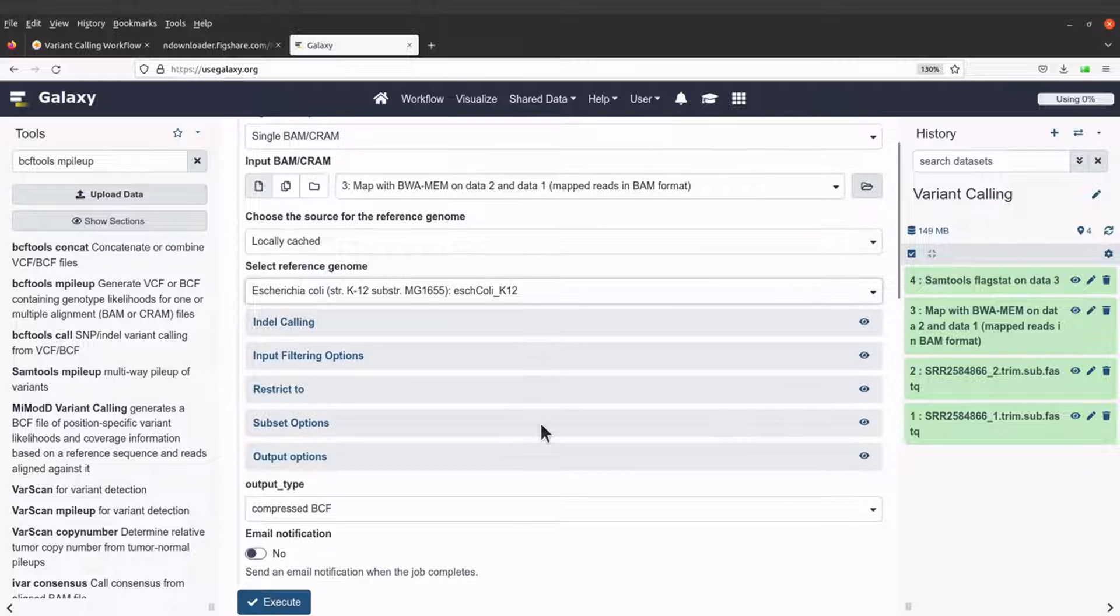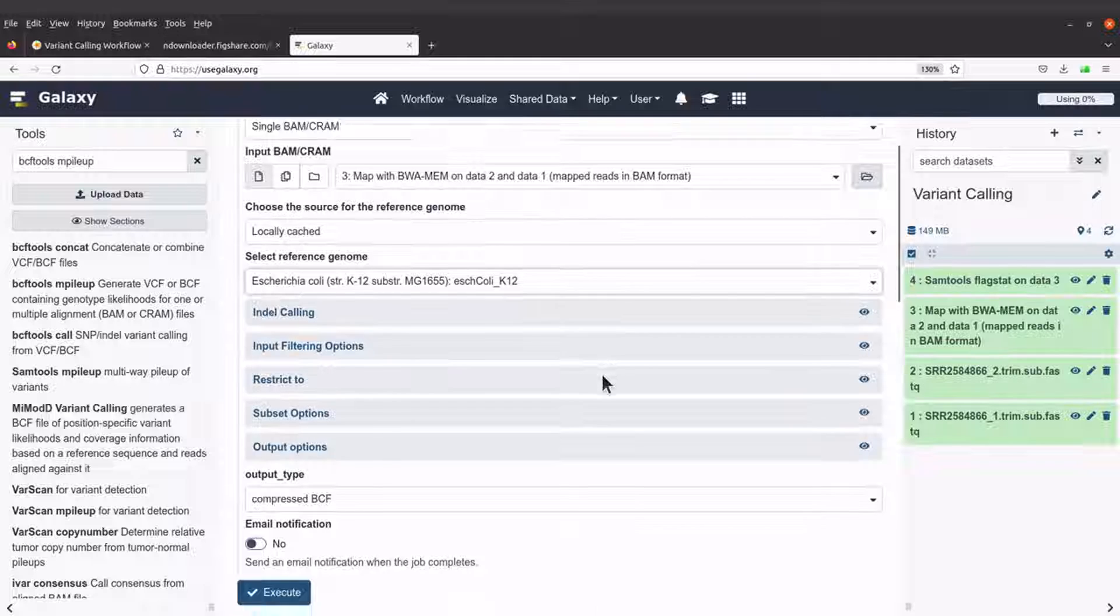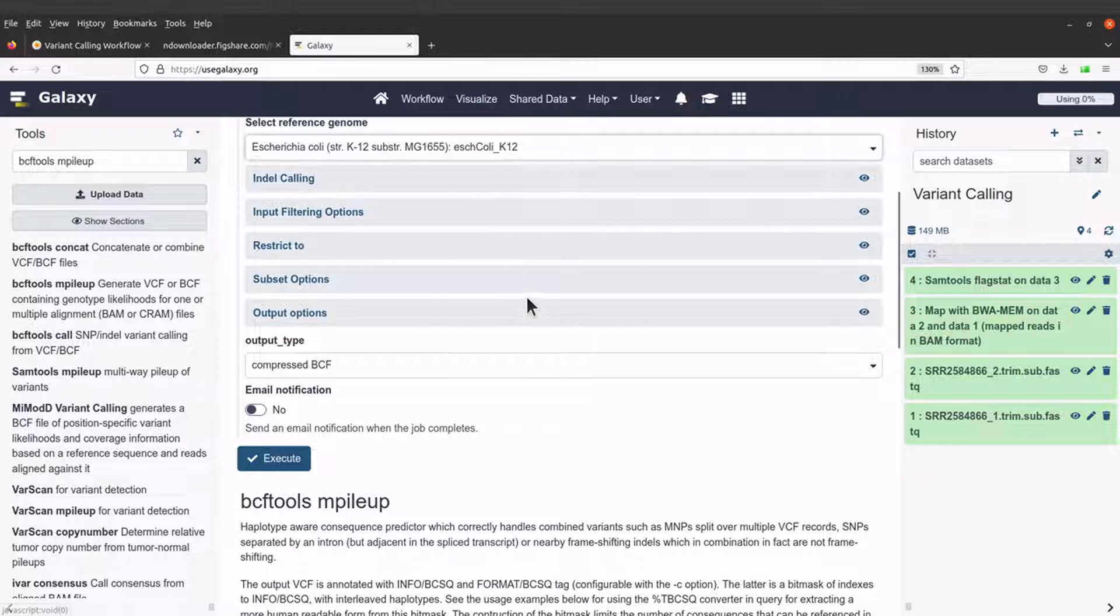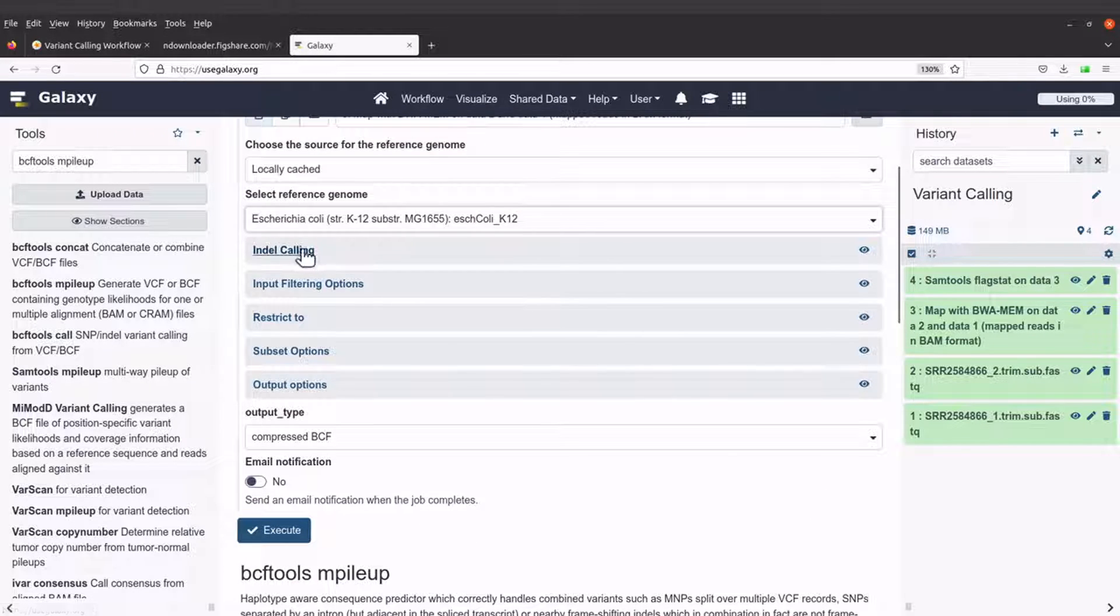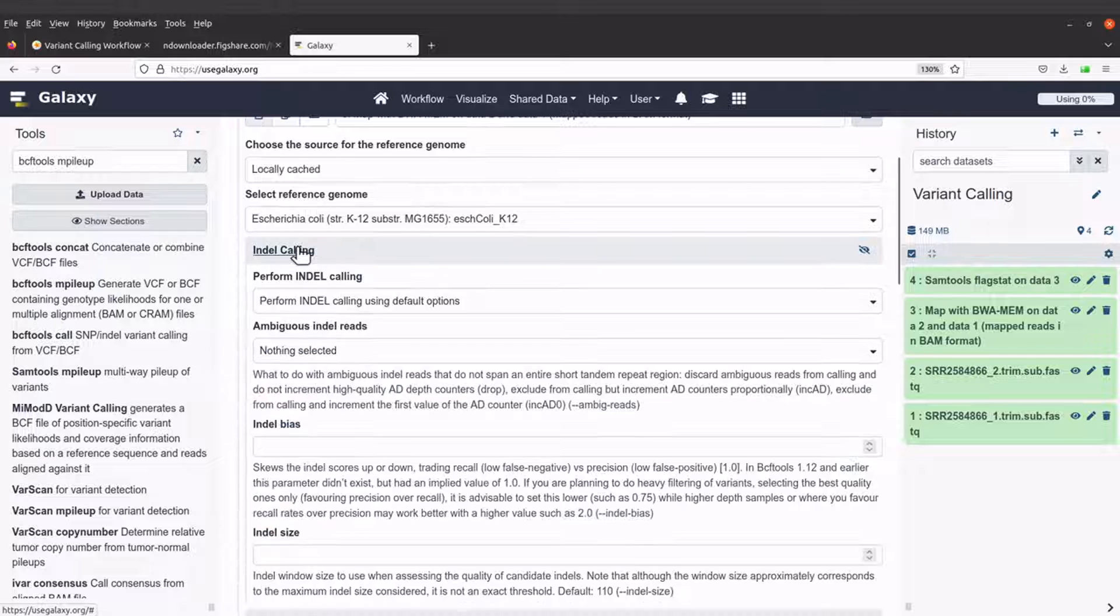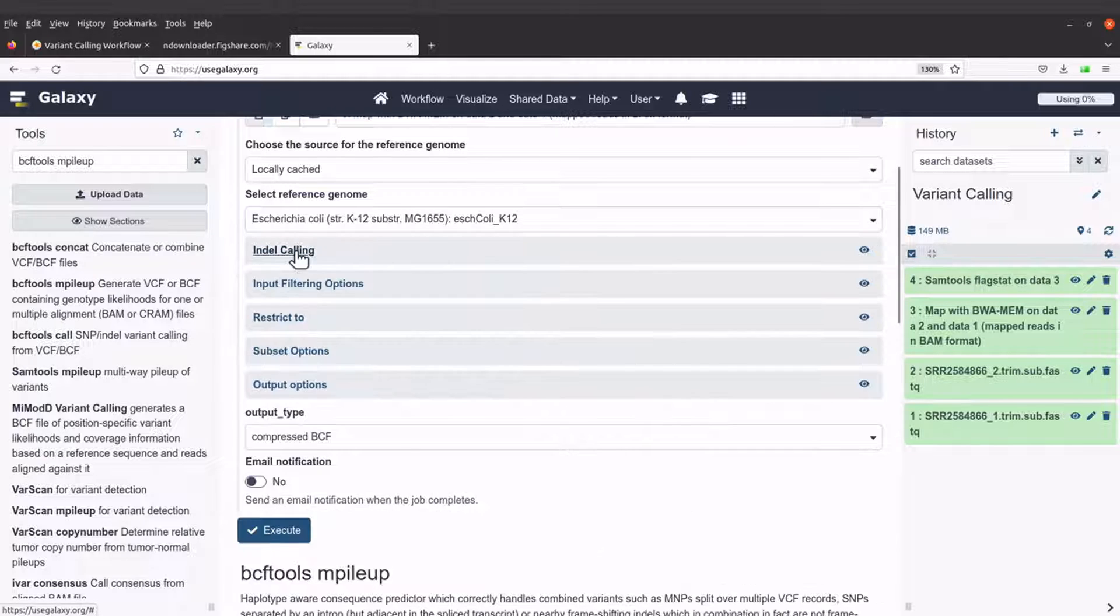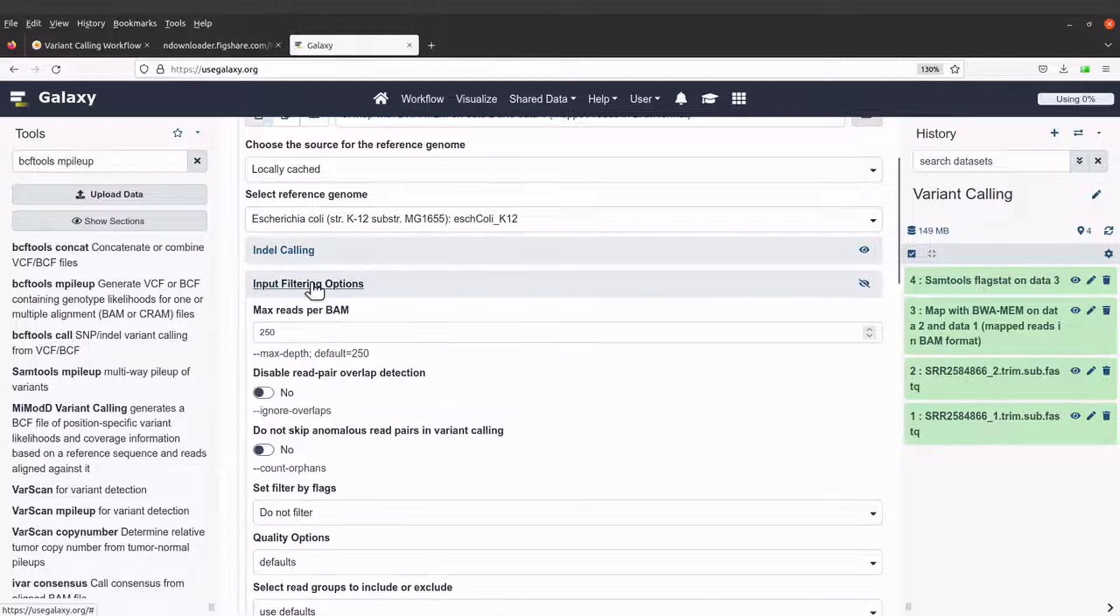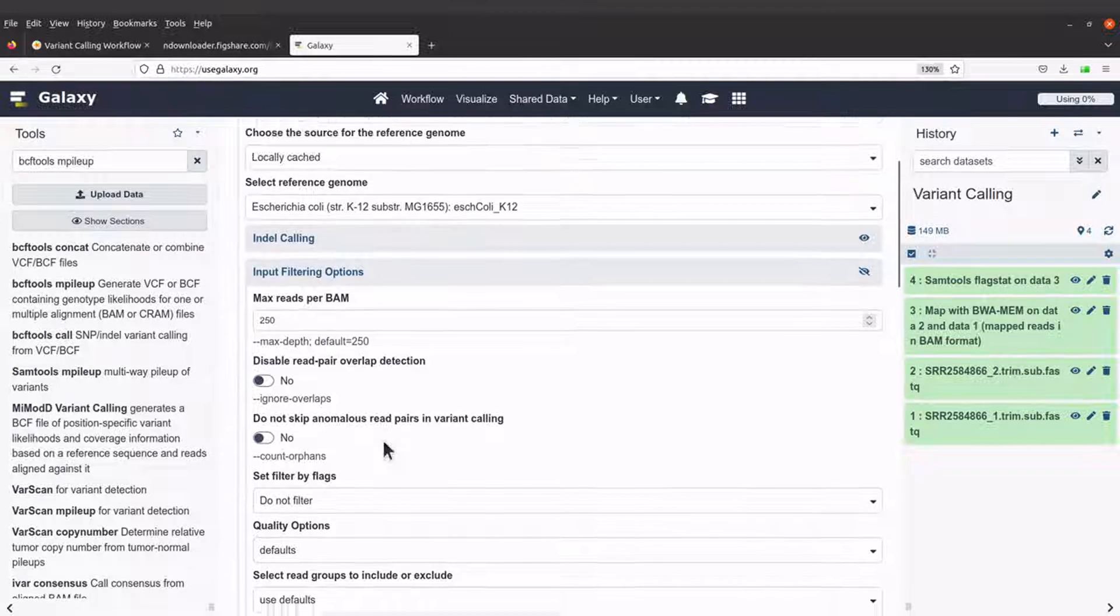Okay, so after that we'll look at another stuff here. Let's check on the input filtering to see what is there. Okay, I think we will leave this input filtering. But here you can do some filtering.